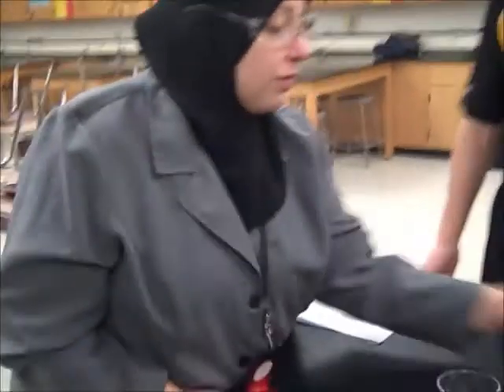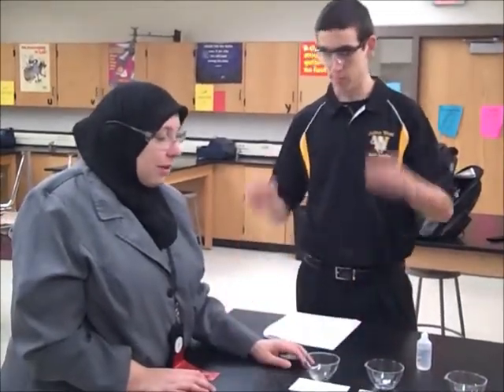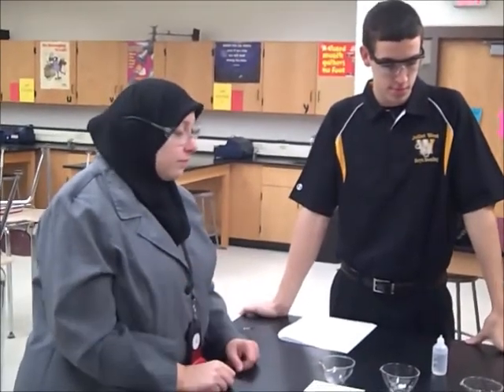So reacting with acid is supposed to be a characteristic of metals. Not all metals are going to react with hydrochloric acid, as we saw. Tin does not. Some of the other ones do, but they all vary in how they react. That's the important part. Okay? Excellent. Thank you, Nick.